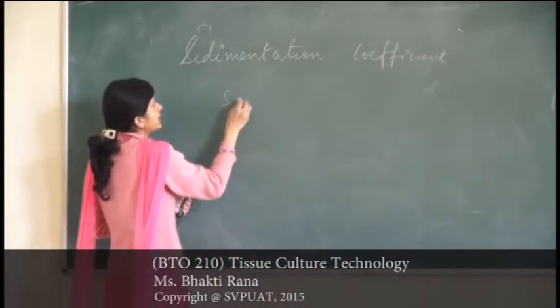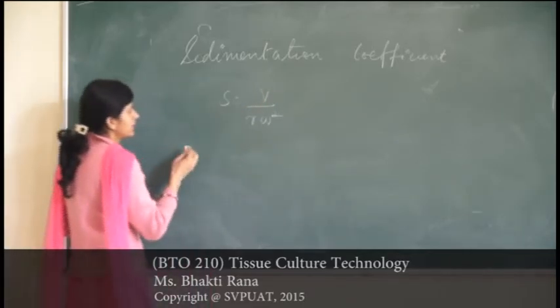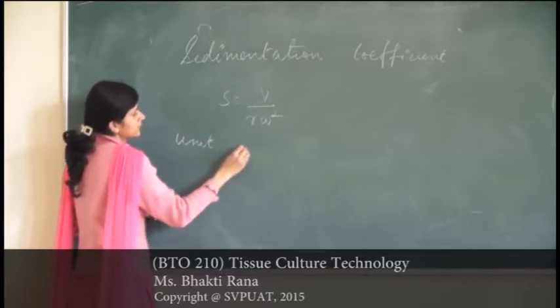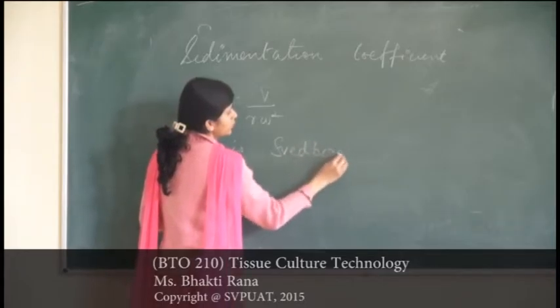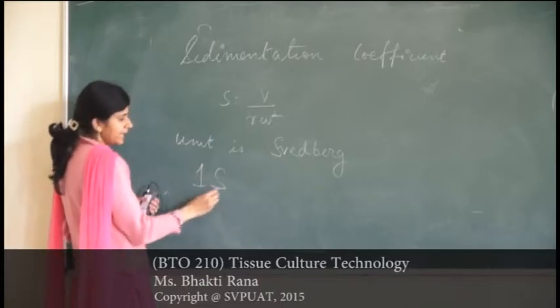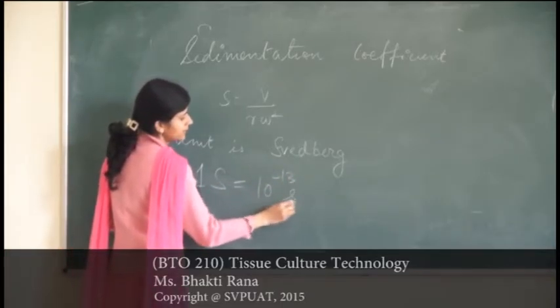Then after that comes the sedimentation coefficient. It comes to be S is equal to v upon r omega square, and its unit is Svedberg, and 1 Svedberg, denoted by S, is equal to 10 to the power minus 13 seconds.